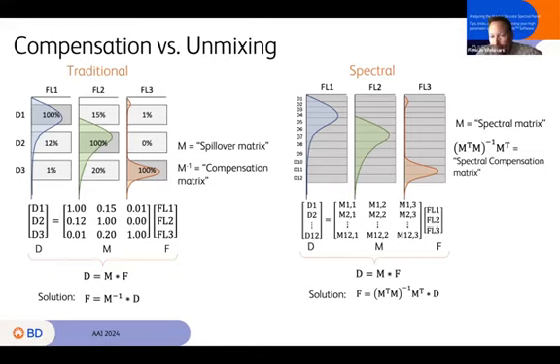We'll end up making a parameter for each one of the fluors that you add into your data, and we'll just have a much bigger rectangular matrix collected of all the signal that we'll have to unmix as opposed to compensate. And really the difference is just that with a square matrix, the inversion step, where we solve this equation of, I'd like to actually suss out what the fluorescence was of my fluorochrome versus what was measured in the detectors, you can just invert that matrix because it's square. You have to do a pseudo inverse if you've got a rectangular matrix from a spectral cytometer. So the math in the background is really similar. And so there's nothing to be afraid of with the unmixing math.